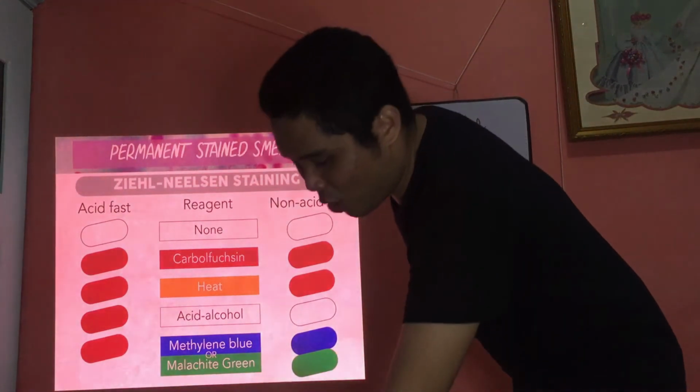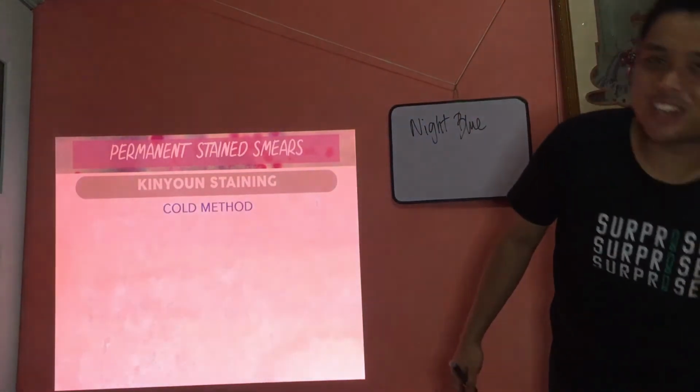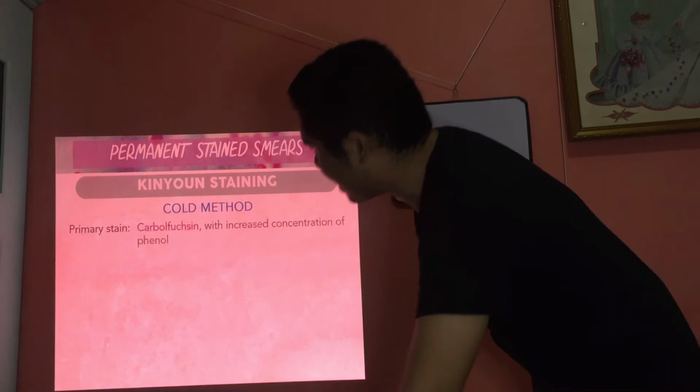Alright, okay. Now, we go now to the cold method, which is your Kinyoun staining. Cold na ba? For the cold method, same procedure, same stains.